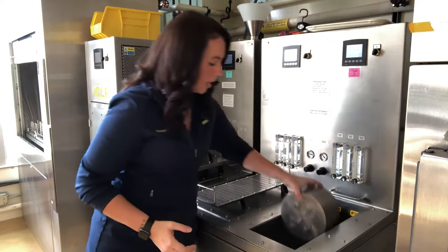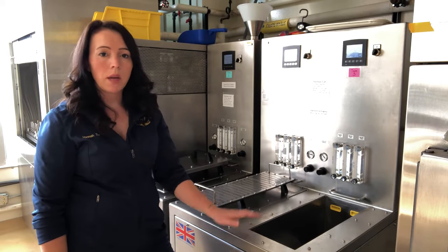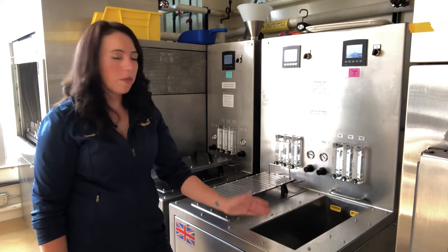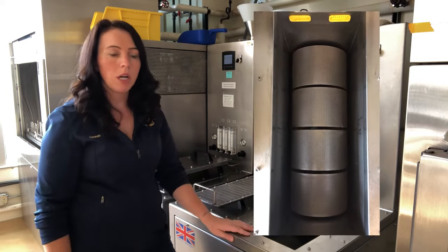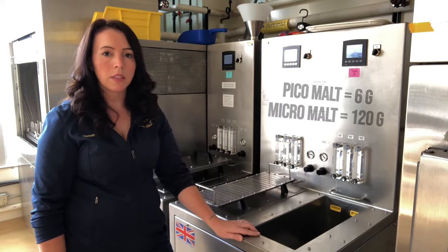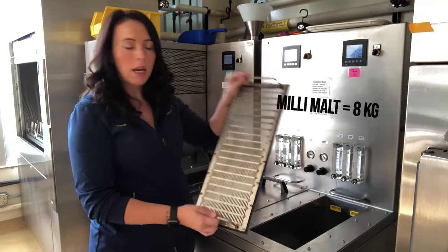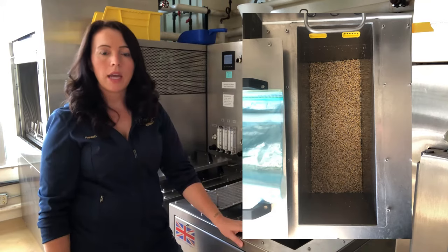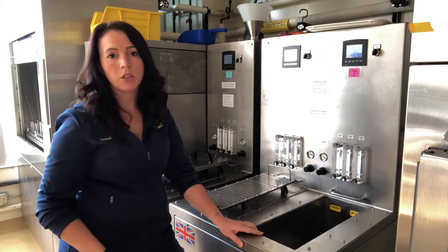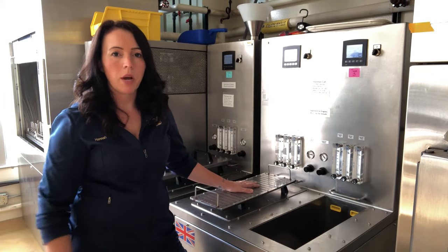These cages load down into the tanks, where we do both our steep and germination phases. Two days of steeping — we're able to fully control when the water comes in, what the temperature is, and aerate with both moist and dry air. We've also got turning rollers in the bottom so we can turn those cages and keep them all evenly treated. About two days in steeping and then about four days in our germination phase. We also have false bottoms that slip into the bottom of the tanks, allowing us to malt up to about eight kilograms per batch. That's been really beneficial as we move into the brewing side of our program — we're able to take barley all the way from initial crosses through the full breeding process, and then malt elite lines at large scale and actually brew with malt we've brought up through our own process.